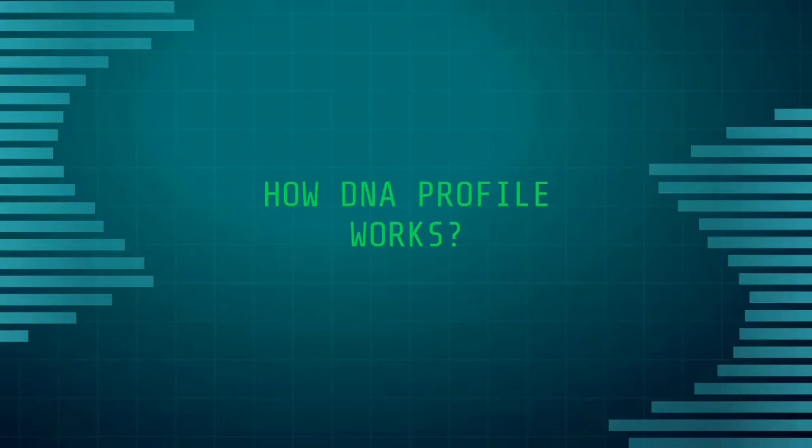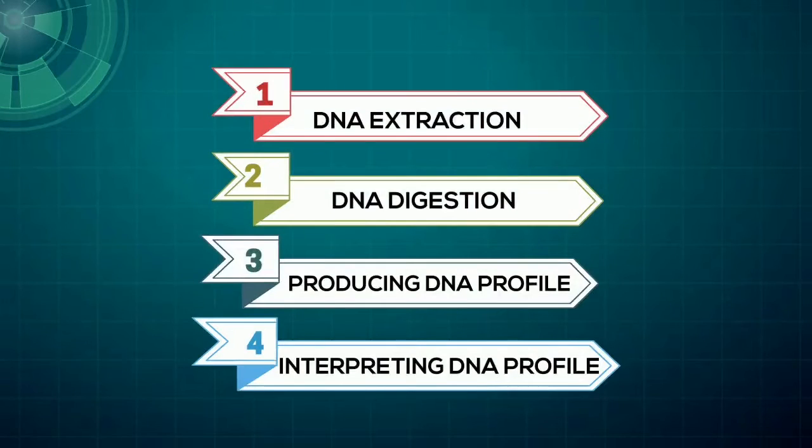How does DNA profiling work? There are 4 steps in DNA profiling. The first is DNA extraction. The second, DNA digestion. The third, producing the DNA profile. And the last is interpreting the DNA profile.